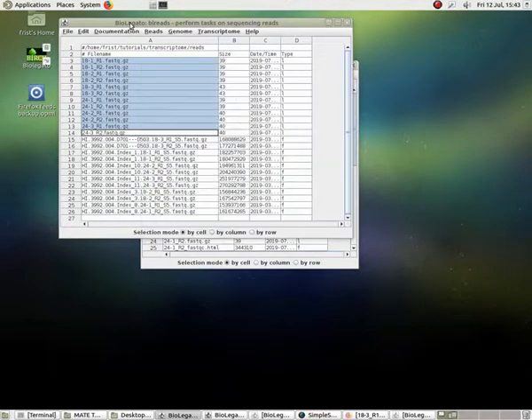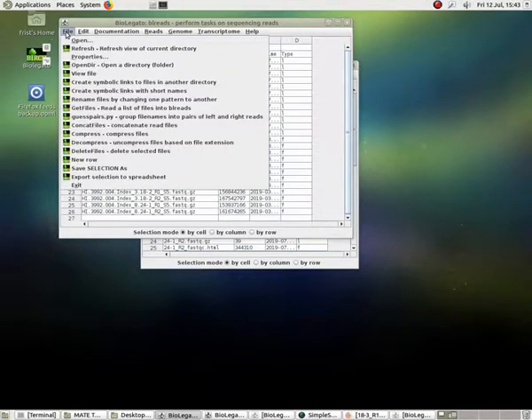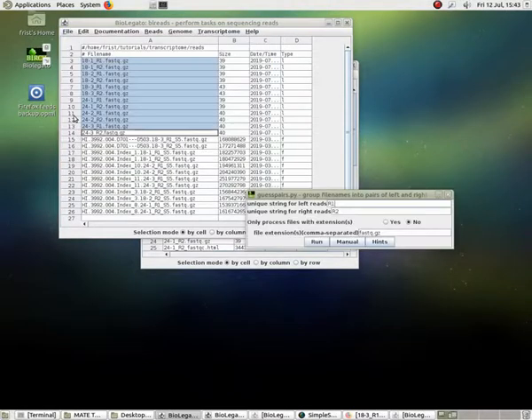Well, once you have that, you can go to these symbolic links and run programs like Trimmomatic to get rid of the adapters. The sequencing adapters have to be removed. And in order to do that, we need to be able to tell Trimmomatic which files belong together as forward and reverse reads. So for this purpose, we've got the guess pairs tool. I'm telling guess pairs here that R1 stands for forward direction, R2 stands for reverse direction, and then to match files that have the file extension fastq.gz.